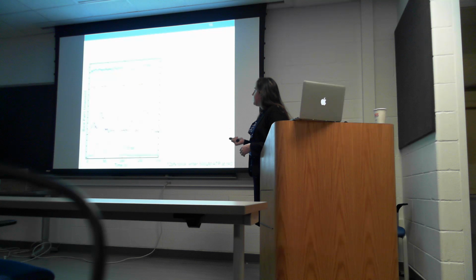You can see as we increase the concentration of RPA, more and more XPD is able to unwind more and more of the hairpin. Again, processivity means the number of base pairs that XPD was able to unwind in one attempt. Each of these traces is one single XPD, and you can see that processivity varies throughout XPD's unwinding. In this case, XPD starts with low processivity, then goes farther on its next attempt, low again, and so forth.